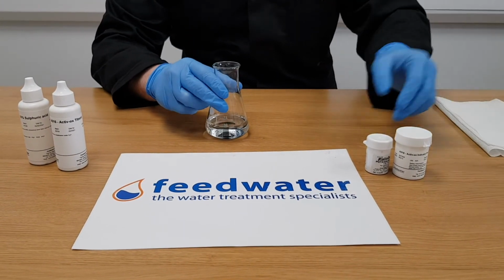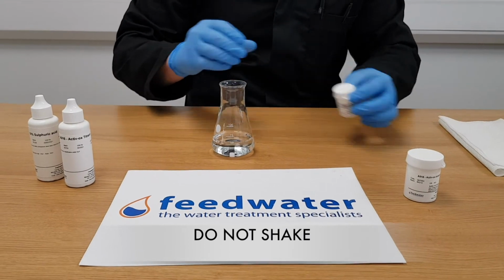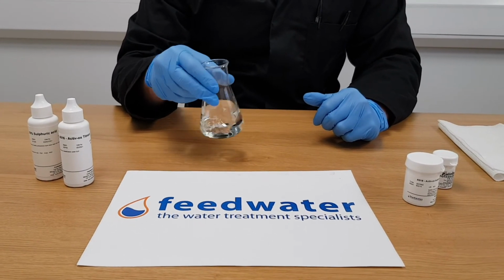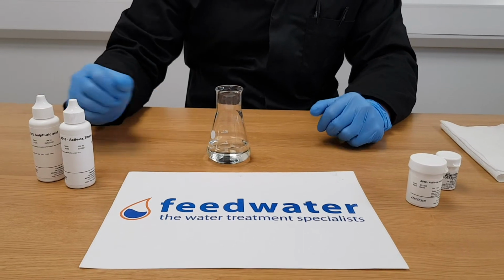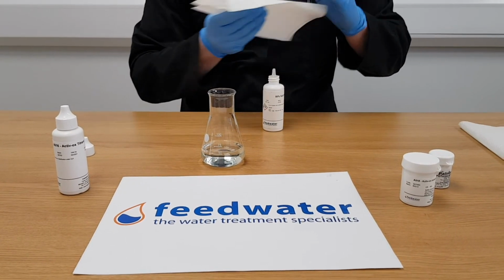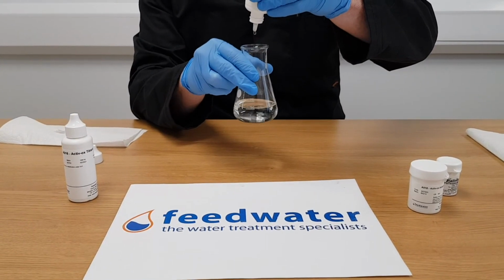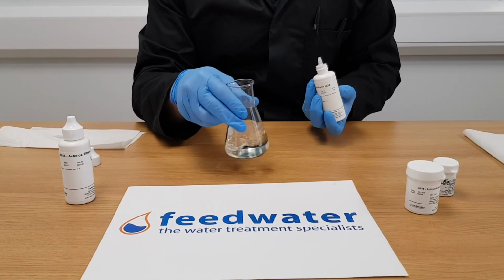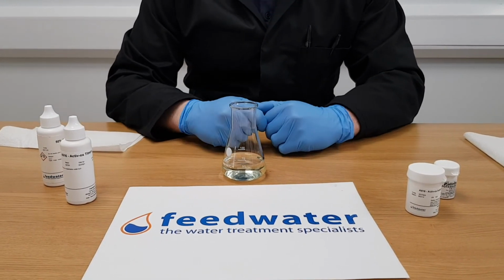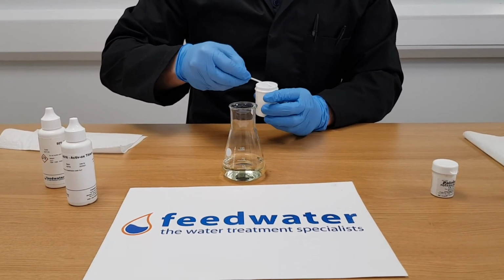First, take the required volume of your sample and add 1 potassium iodide tablet and swirl for 10 seconds. Do not shake. It is not essential that the tablet is fully dissolved. Add 5 drops of 50% sulfuric acid. Add a small amount of Activ-Ox indicator powder. If oxidant is present and the sample is not too hot, the sample will go a blue-black colour.